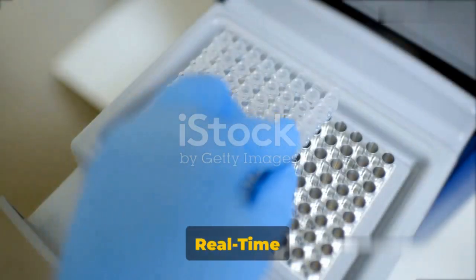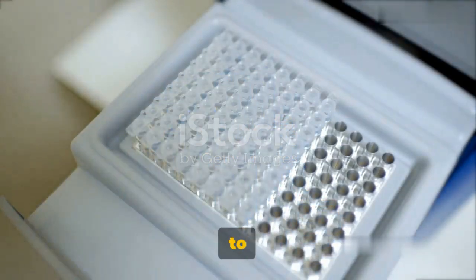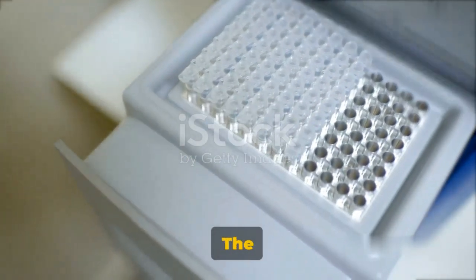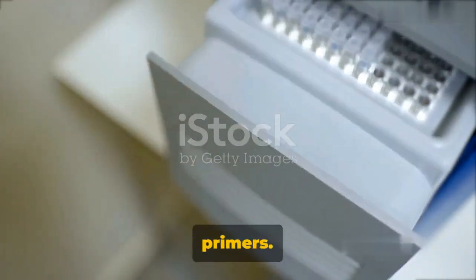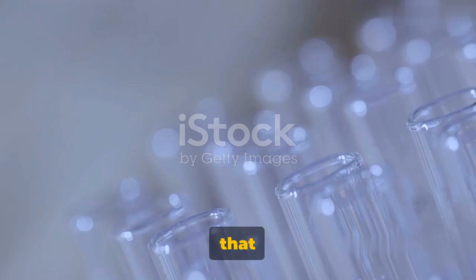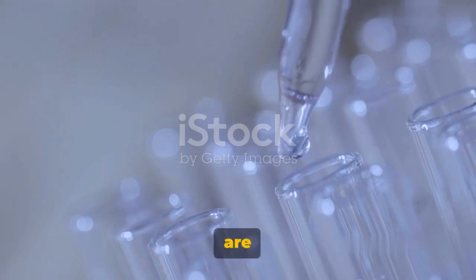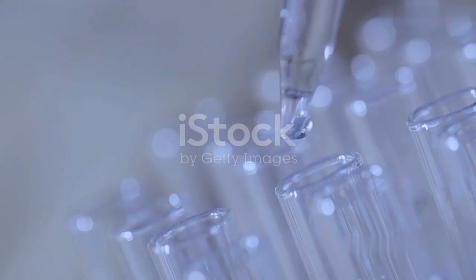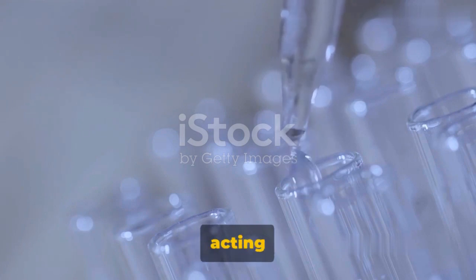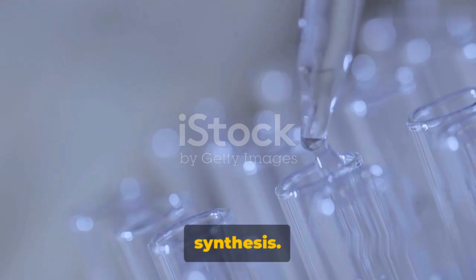Understanding the process of real-time PCR is crucial to appreciate its significance. Let's dive into the step-by-step process of real-time PCR. The first thing we need is a pair of primers. These primers are nothing but short DNA sequences that are complementary to the DNA sequence we are interested in amplifying. Now, these primers attach themselves to the DNA strand, acting as the starting point for DNA synthesis.